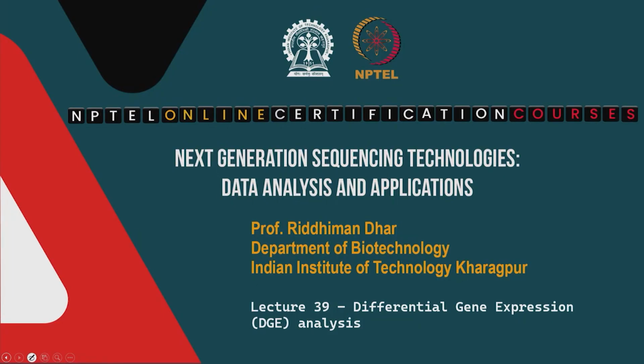Good day everyone, welcome to the course on next generation sequencing technologies, data analysis and applications. In the last few classes we have covered the preliminary steps for transcriptomic data analysis. Namely, we have talked about transcriptome assembly, we have talked about normalization, and now we are ready for the main analysis. This is a very popular analysis that we do on transcriptomic data sets, and it is called differential gene expression analysis.